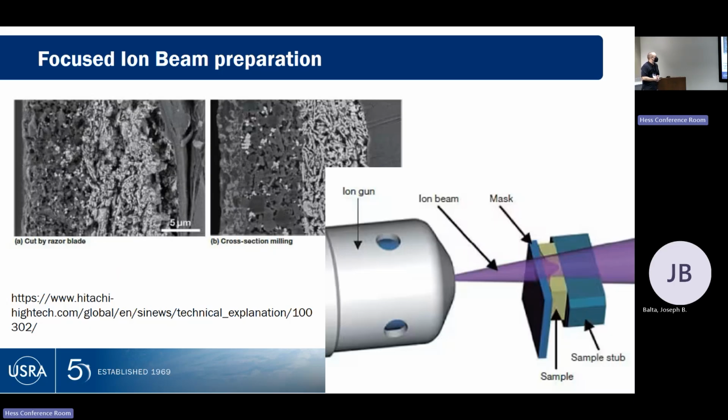Okay, a focused ion beam is, here's my sample. I create a beam of ions. I slice through my sample and create an extremely thin, extremely small piece of my sample that I often will move around inside the microscope. So many of these are actually either directly attached to a scanning electron microscope or a transmission electron microscope. You literally slice the bloody thing off, use a micromanipulator inside the machine to grasp the piece you broke off, and take it over to your sample tray.